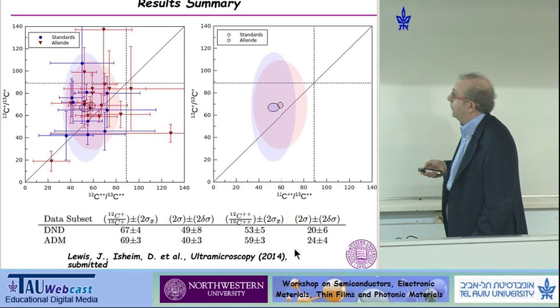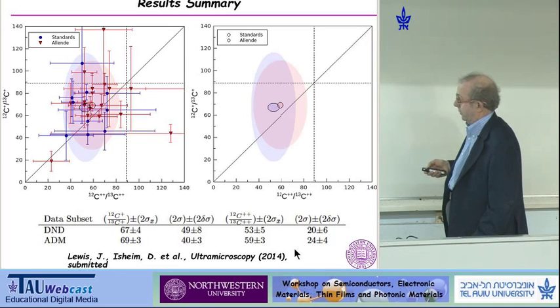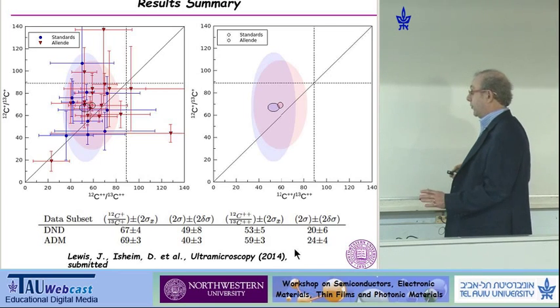This is not the standard deviation, but this quantity sigma sub xm is a measure of the precision of the measurements. This sigma over here is the scatter of the specimen results, and ideally you want this sigma, which is the precision, to be very small. And we did it for the singly charged and the doubly charged, and there are differences.